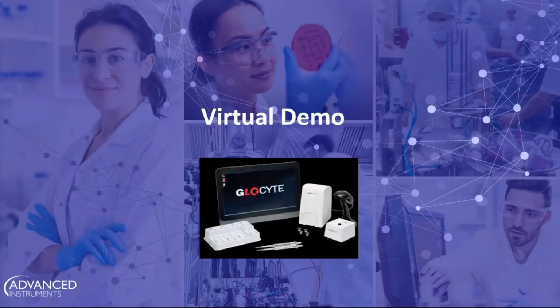Now, like I said, someone like me who's a little bit slower can take upwards of 45 minutes. The beauty of the GloCyte is as well, it's automated. It takes all the guesswork out of everything. So you don't have to worry about, okay, did Jordan count 3 cells? Did Nick count 10 cells? Did Julie count 5 cells? It really is accurate and ultimately precise.